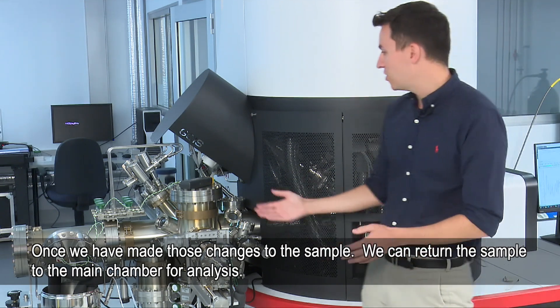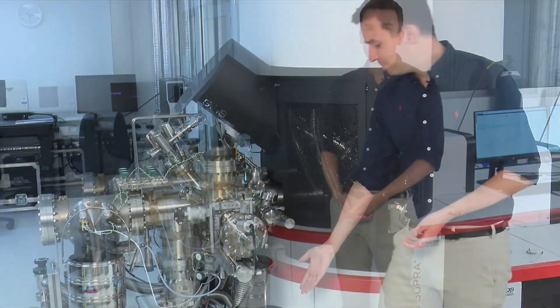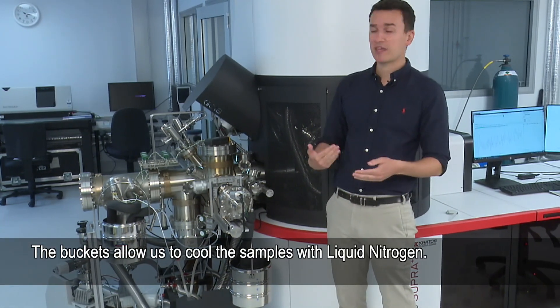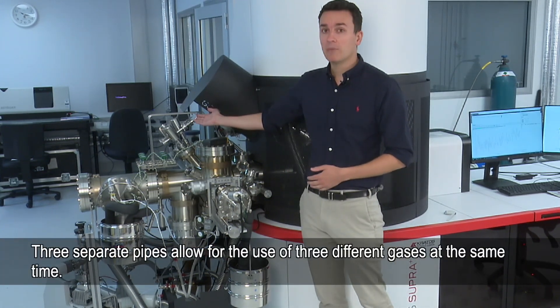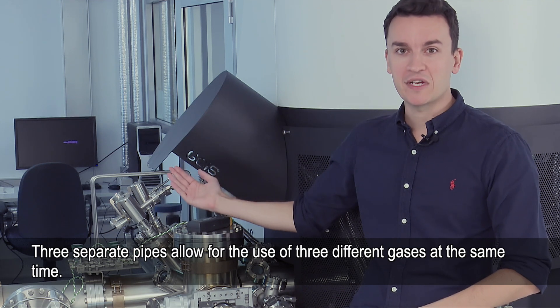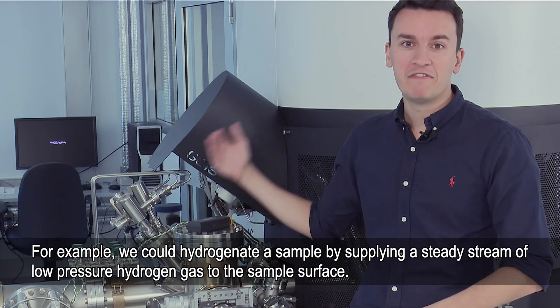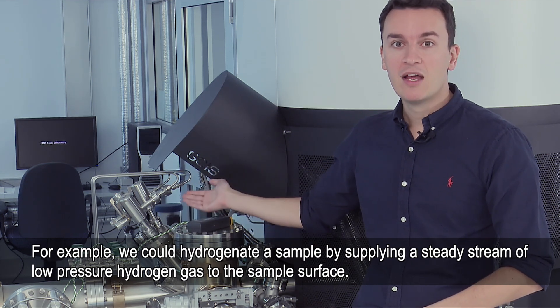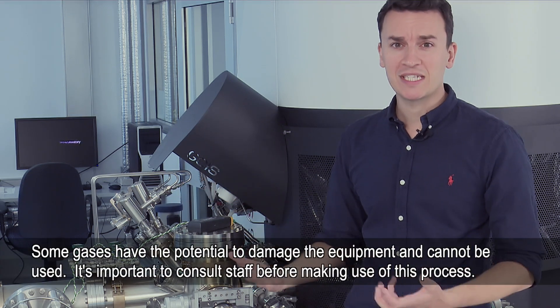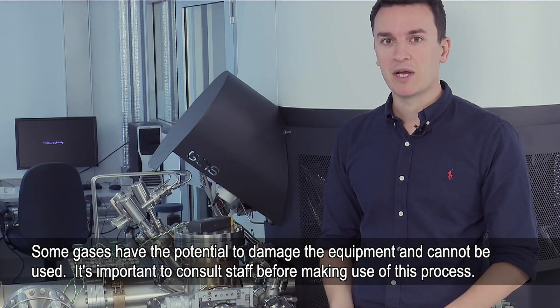It looks quite complicated but it has a few particular features. These buckets here are for cooling samples with liquid nitrogen — we add the liquid nitrogen to the buckets to cool the samples down. These pipes here at the top are the gas dosers. We have three separate pipes so we can have three different gases at the same time. For example, we could hydrogenate a sample by adding a very low pressure, very steady stream of hydrogen through the nozzle onto the target. There are certain gases we can't use as they might damage the equipment, but that's something you can discuss with me on a case-by-case basis.